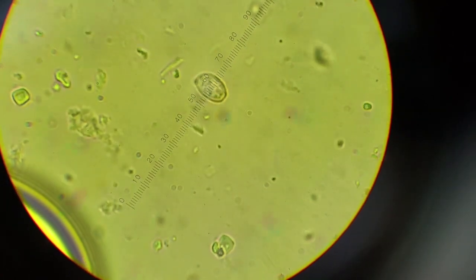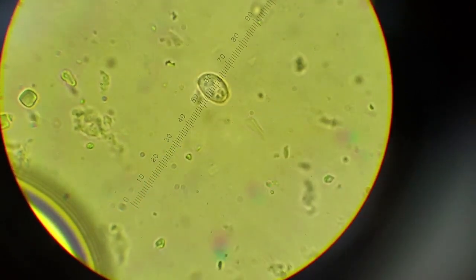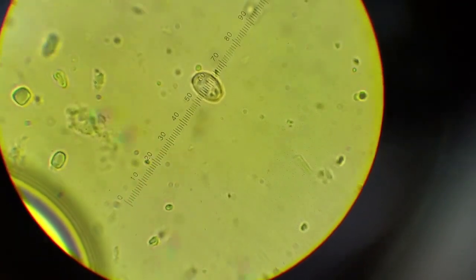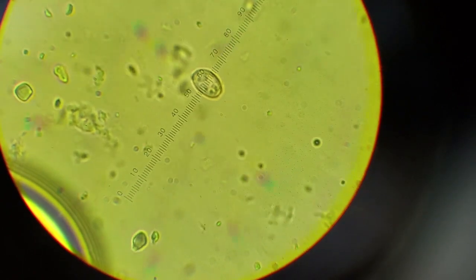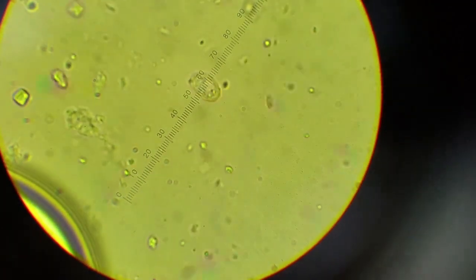This one looks much more ideal than all the other spores that I found. So what you would do is you locate the adaxial flattening, you take that measurement, and you can see the apiculus in this case is to the top left corner of this spore. The adaxial flattening would be to the bottom left. And so you take your measurement there, then you would rotate to take, let's see if I can rotate this, almost.